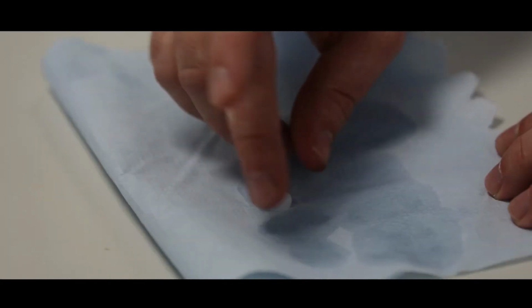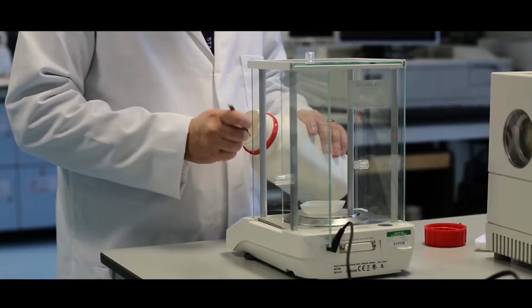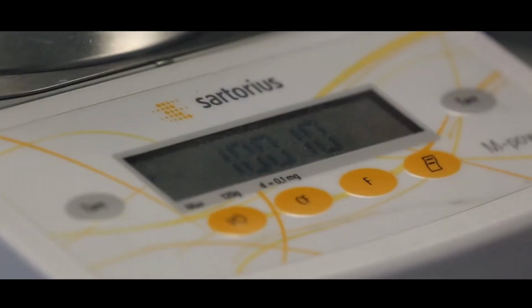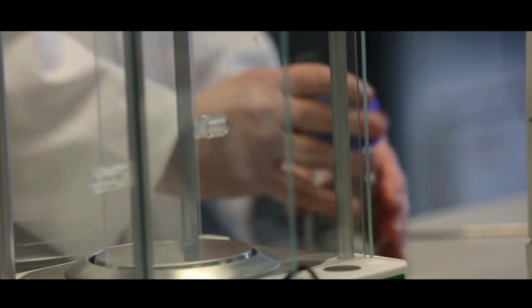One exciting area of our research is using marine polymers to create a range of sponge-like materials called Cryo Gels. Here's Ian in the lab weighing out agarose and fish gelatin to make a Cryo Gel. Cryo Gels are composed of ingredients, including water, that form conventional jelly-like substances called hydrogels at room temperature. Dessert jelly is one example, but others are used for medical purposes, such as in wound dressings.